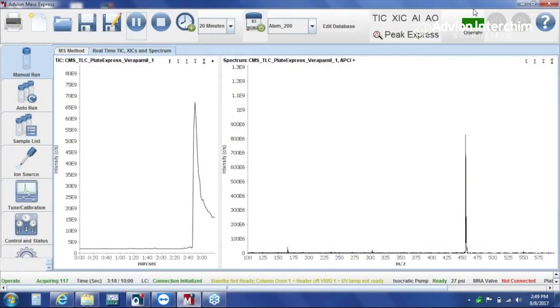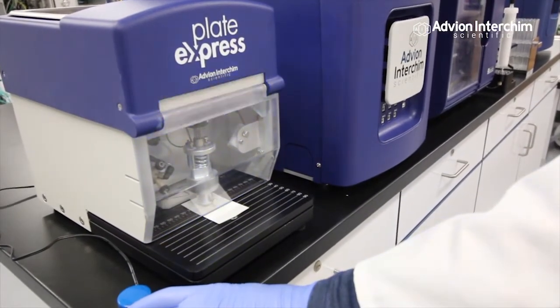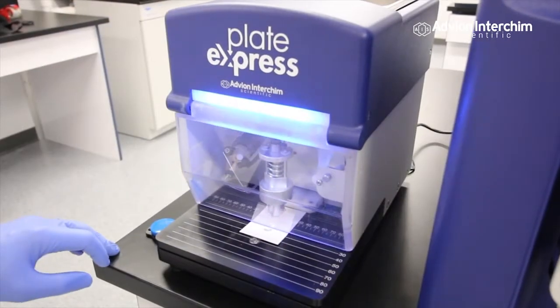View your data in the easy to use MassExpress software. TLC-MS makes reaction monitoring fast and easy, from sample to answer in seconds.